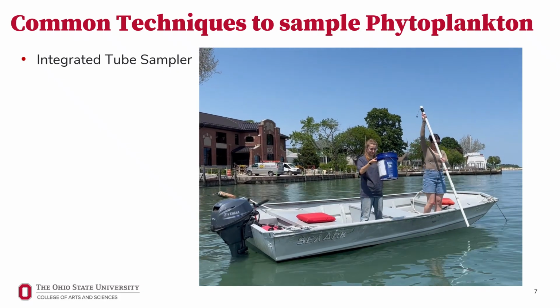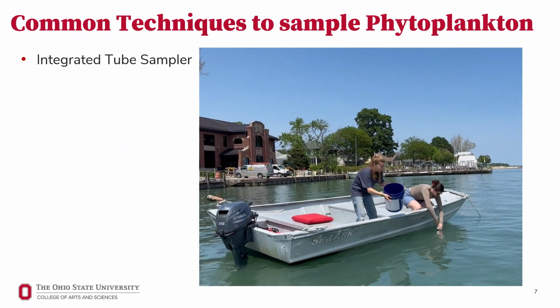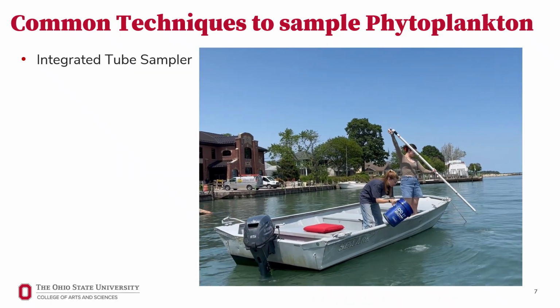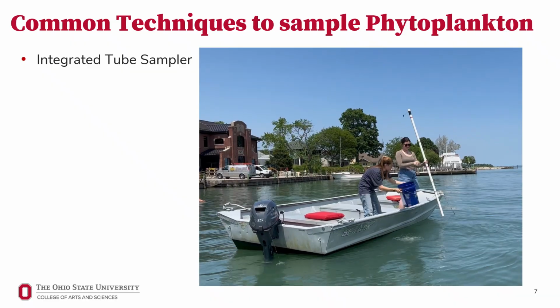Alessia and Kelly first rinsed the bucket and tube sampler with water from the sampling site. You will notice that they do not touch the inside of the bucket. This is to prevent contaminating the sample with anything that might be on their hands, such as lotion or sunscreen.